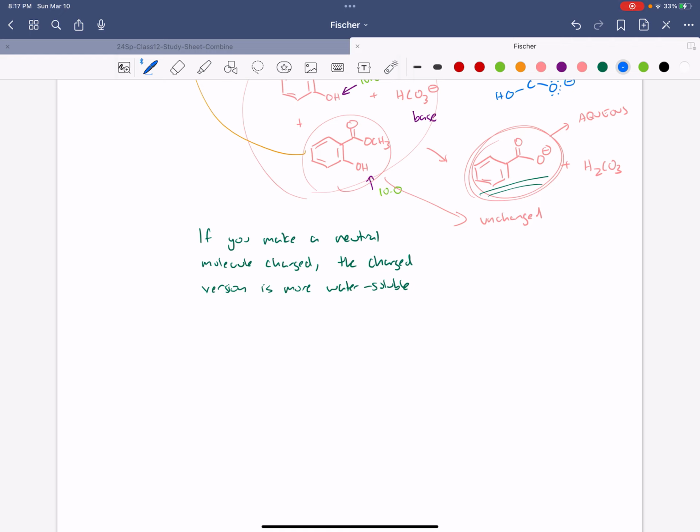So let's say here water soluble, and on this side water insoluble. And so the water soluble, I'm going to say for this lab and for this semester, if your molecule is charged, let's call it water soluble. So let's say any charged ion or molecule.